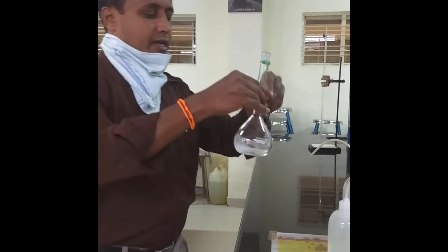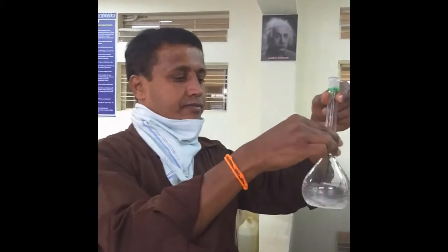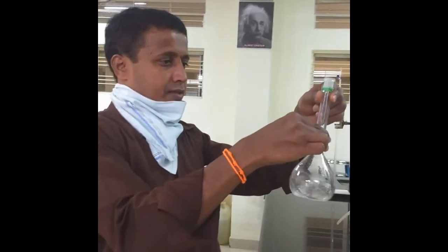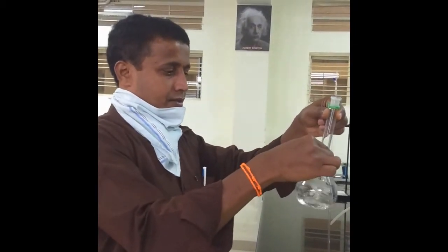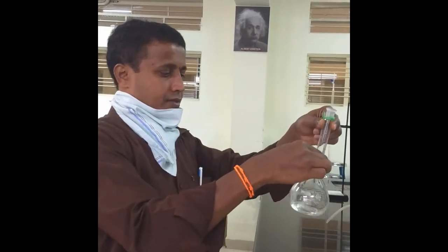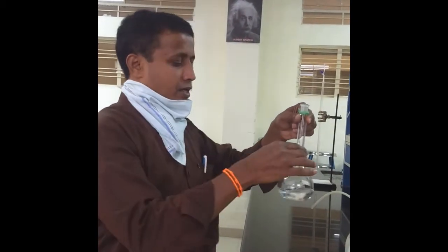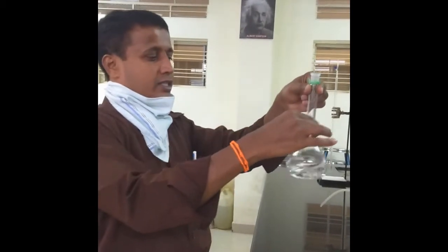It needs to be dissolved with the minimum quantity of added distilled water. Slowly, with constant shaking, to ensure that all crystals are dissolved — like that, I am adding distilled water.